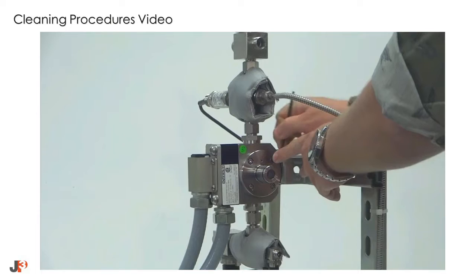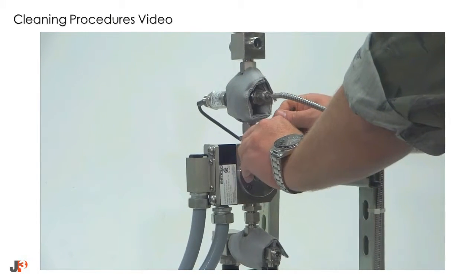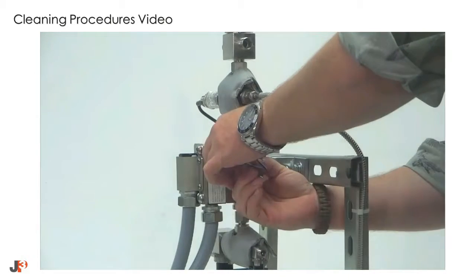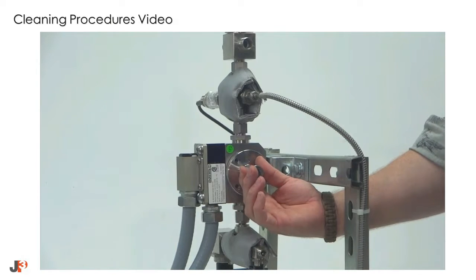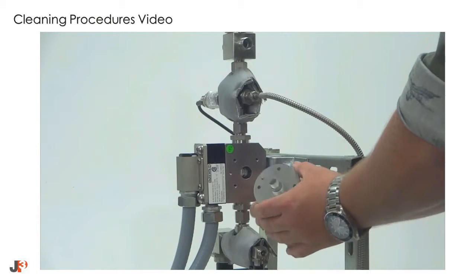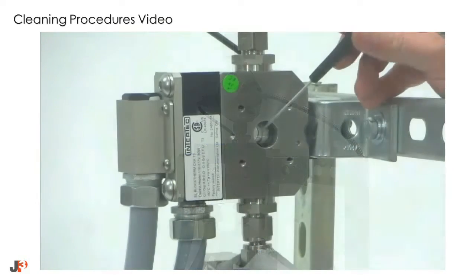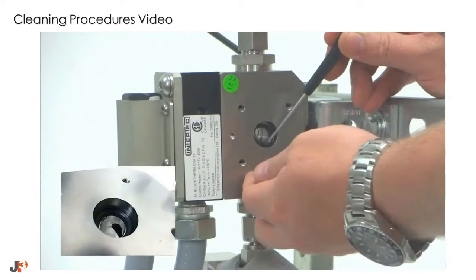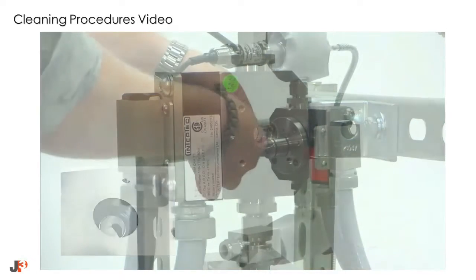Loosen and remove the flanges from the flow cell. Note that each flange is keyed to only fit on one side of the flow cell. Once the flanges are removed, make sure to remove both of the main block O-rings.